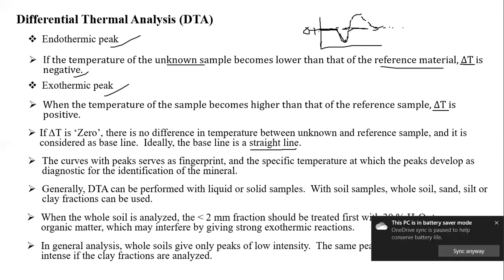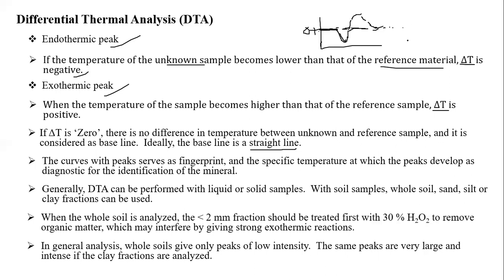But if there is no temperature difference, what will happen? It will only be a straight line. It will follow the baseline. Better, I will show the original graph which is included in this PPT.